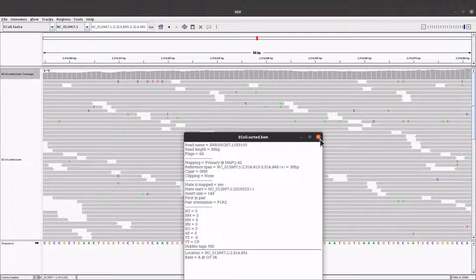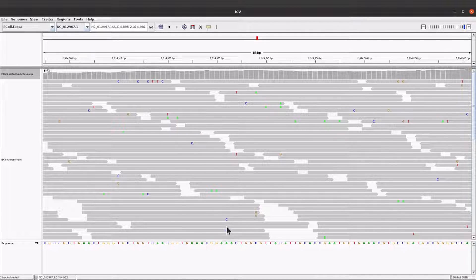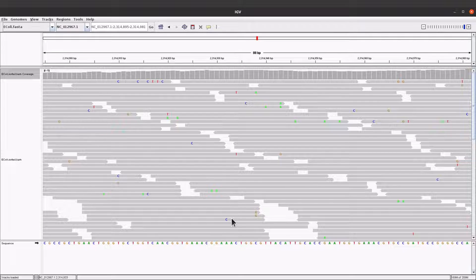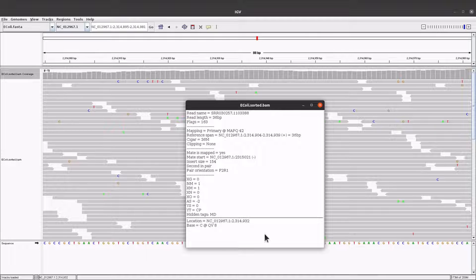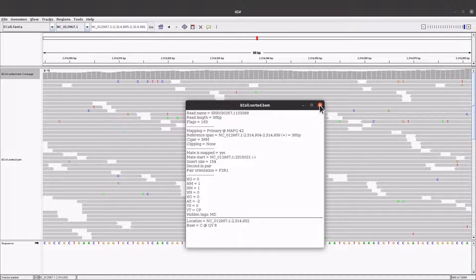The event here is a mismatch. The colors are given in different shades - if the color is light it indicates low quality, if the color is thick or in bold form it indicates high quality. To check the quality for each of these bases, click on it and you have information coming up. You have the mapping quality and also the base quality, so you can use that to check quality scores and see which ones are low and which ones are high.